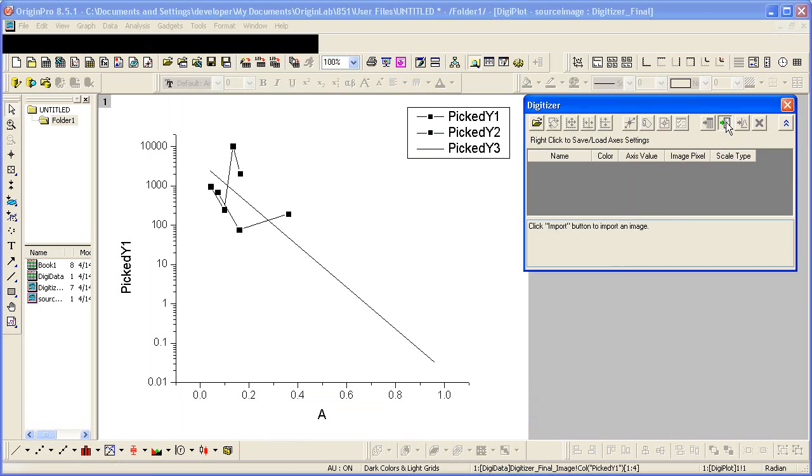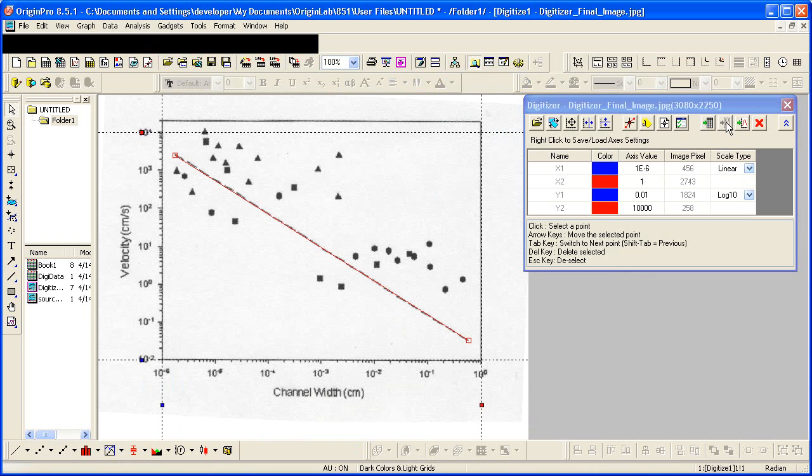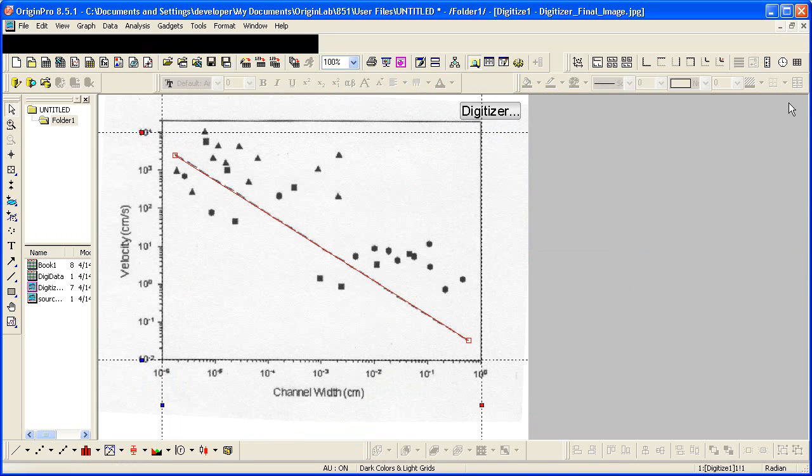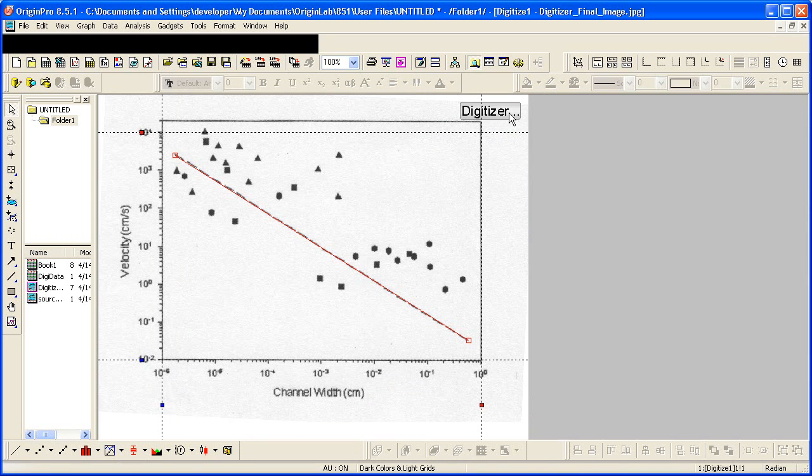This lets me get back to the image. When I close this dialog, this would delete the results here. But hitting the X would close the dialog itself and it would leave a digitizer button on the graph.